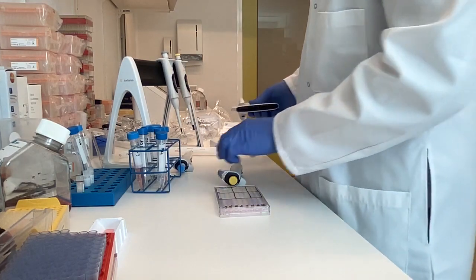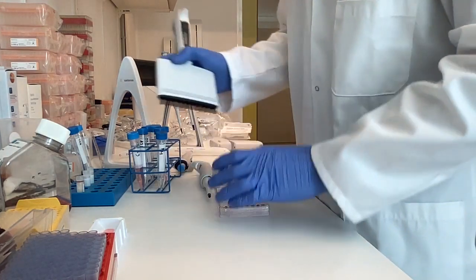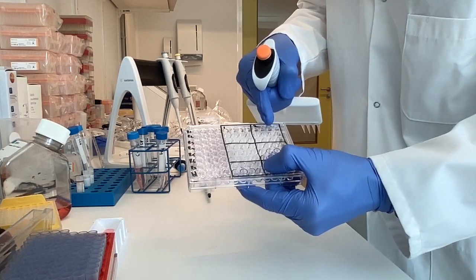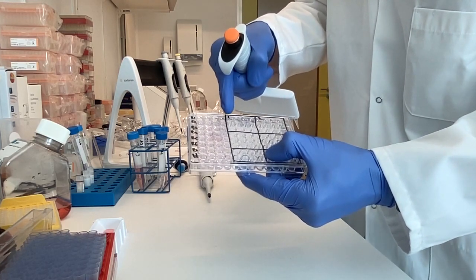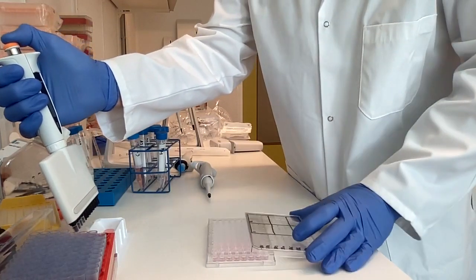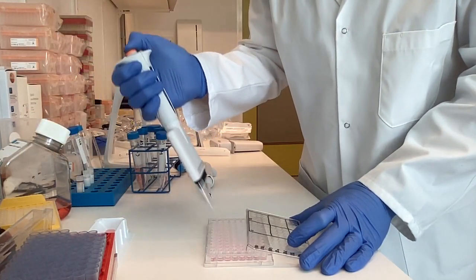So here we're going to do the same thing: either you can use a multi-channel, or you can do it manually one by one with a single pipette. But what I prefer is that you take a multi-channel and pre-fill. In this case, these upper rows are product 1, product 2, and the non-spiked samples in the 3 different dilutions. And we're going to do the same serial dilution. Our product that we've prepared in the tube will be row A, but for row B and row C we're going to do a serial dilution again. So you can pre-fill these with RPMI, 100 microliters. That's what I'm going to do. So in B and C, from 4 to 12, I'm going to pre-fill just with RPMI.